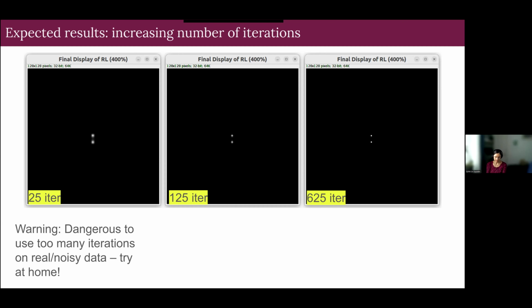So I have a question about this. Is there any advantage in denoising the image first? There is, and there was a paper in Nature last year about that. I think even I saw it in Hans' lecture. So there's a paper called, I think, sparse deconvolution. Yes, you spoke about that. Yeah.